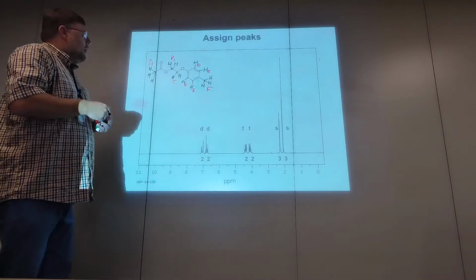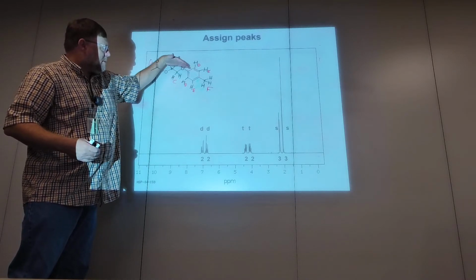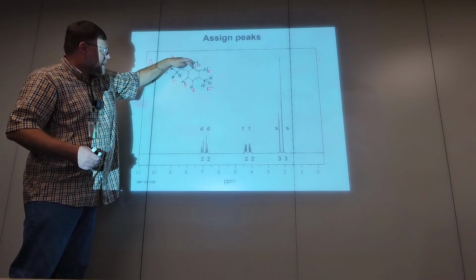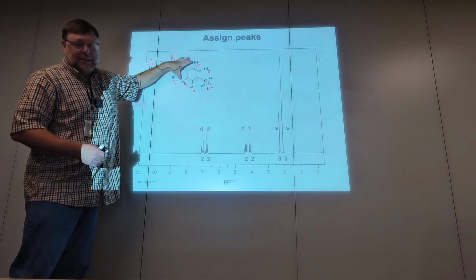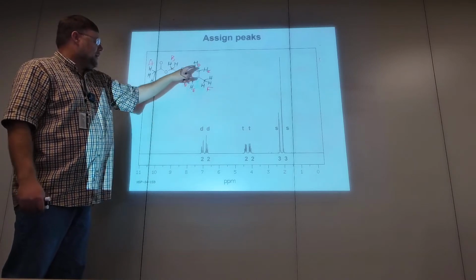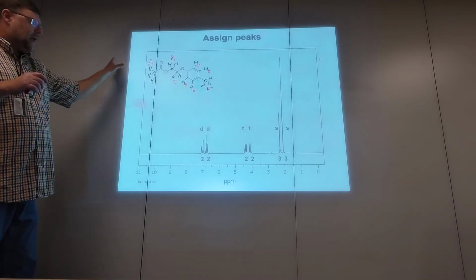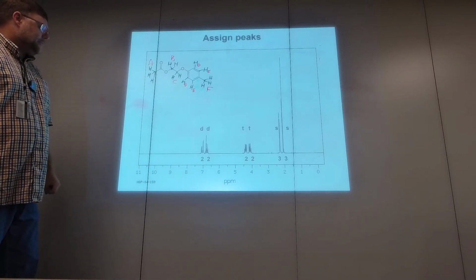And again, when you have a flat benzene ring that's substituted directly opposite each other, there's going to be a plane of symmetry running there. So that carbon is magnetically equivalent to that carbon, and the H's thereon are also magnetically equivalent. So these are both D, these are both E. All right, so if you want to hit pause again and, if you lettered them differently, make heads or tails out of that, do so.